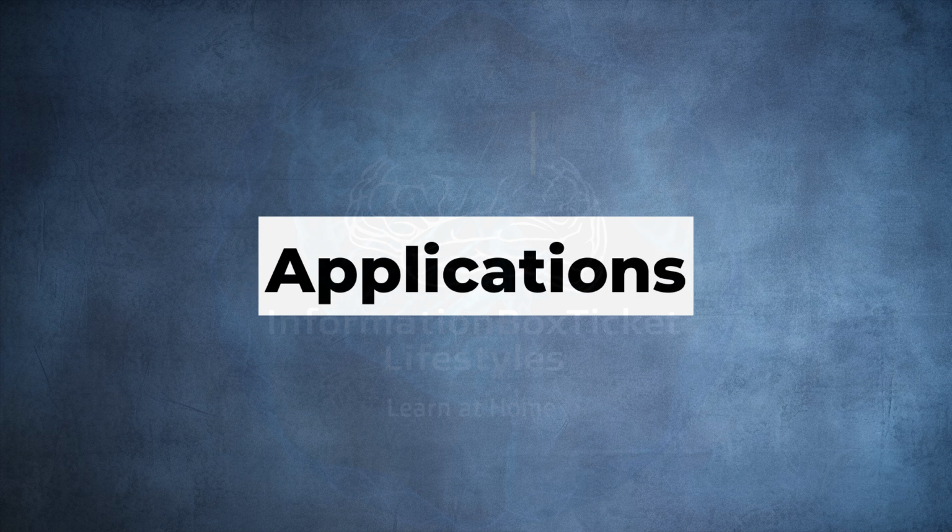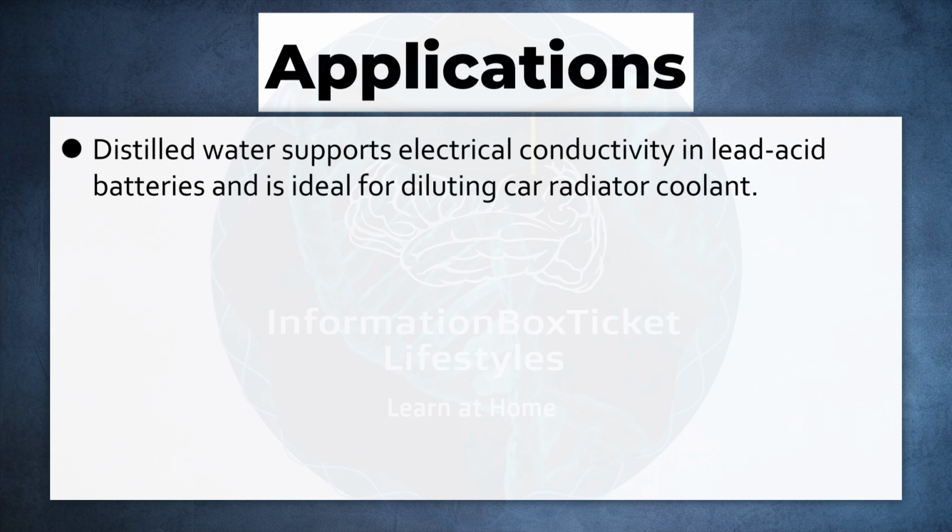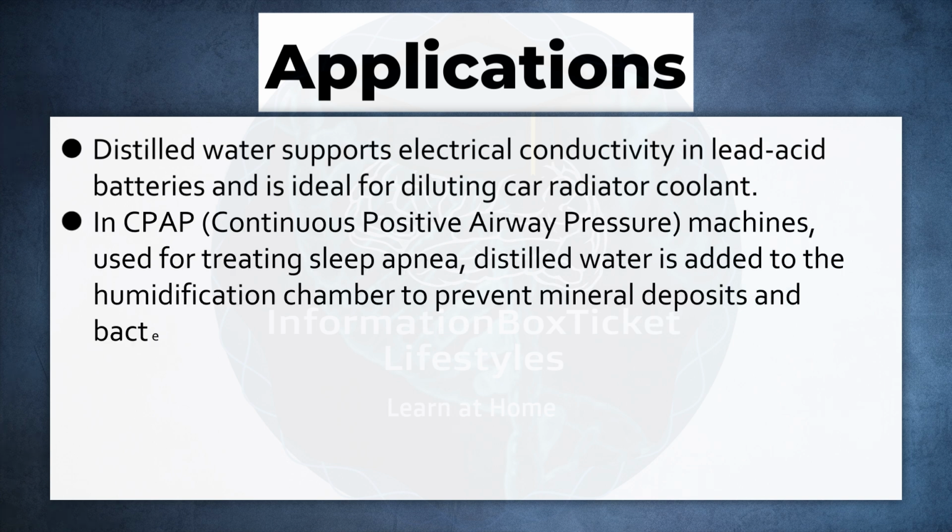Applications of water distiller. Distilled water supports electrical conductivity in lead-acid batteries and is ideal for diluting car radiator coolant. In continuous positive airway pressure machines, used for treating sleep apnea, distilled water is added to the humidification chamber to prevent mineral deposits and bacterial growth.